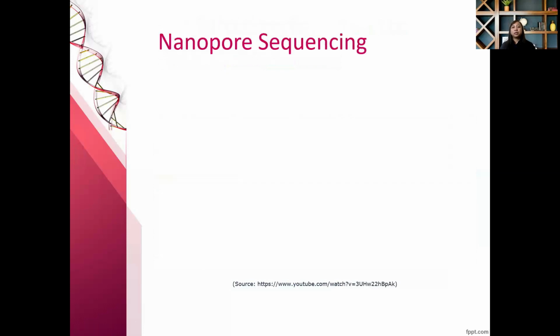And the next is how to analyze DNA with nanopore sequencing. Nanopore sequencing is a unique, scalable technology that enables direct, real-time analysis of long DNA or RNA fragments. It works by monitoring changes to an electrical current as nucleic acids are passed through a protein nanopore. The resulting signal is decoded to provide the specific DNA or RNA sequence.